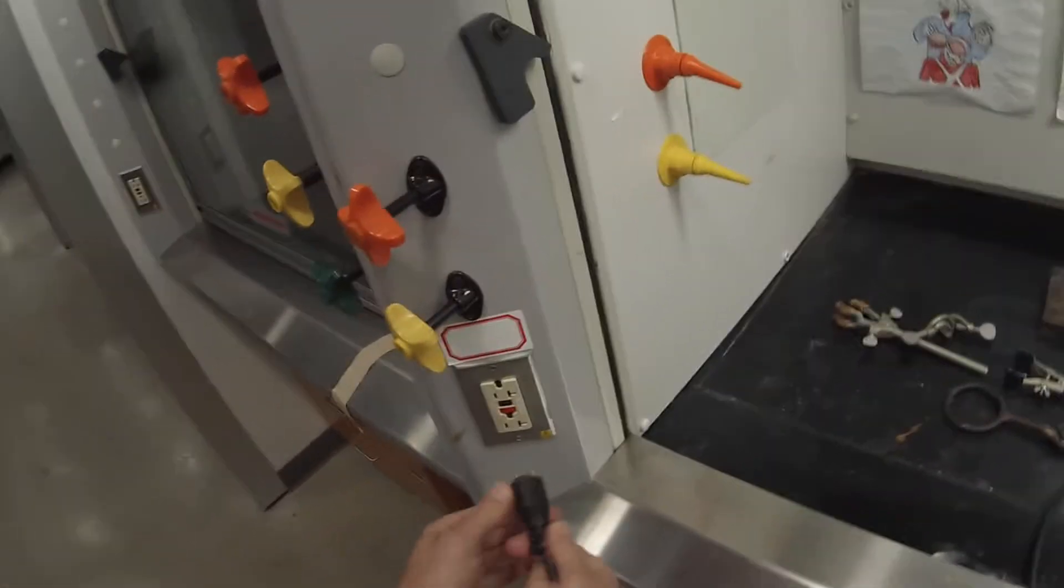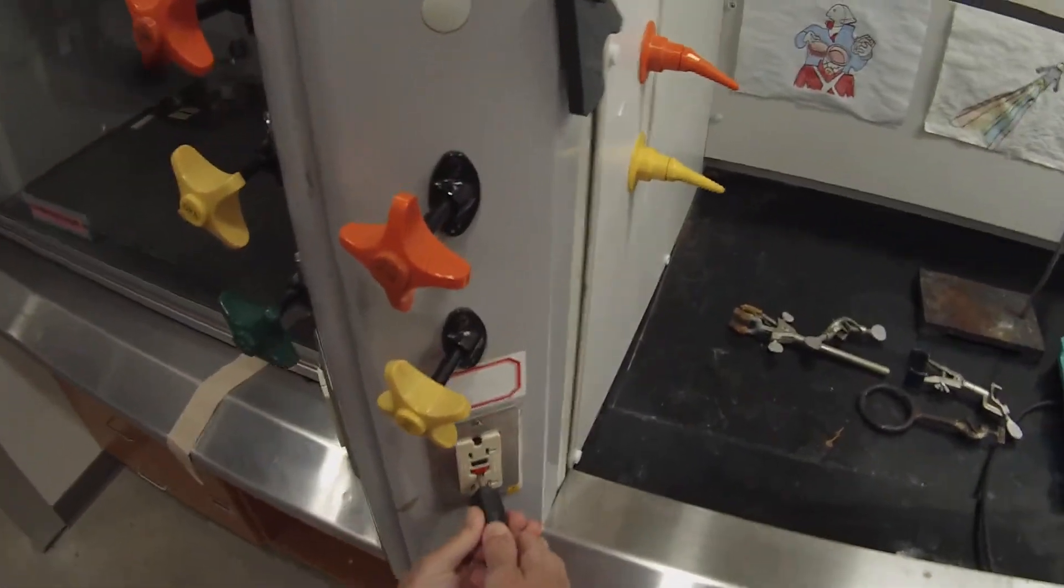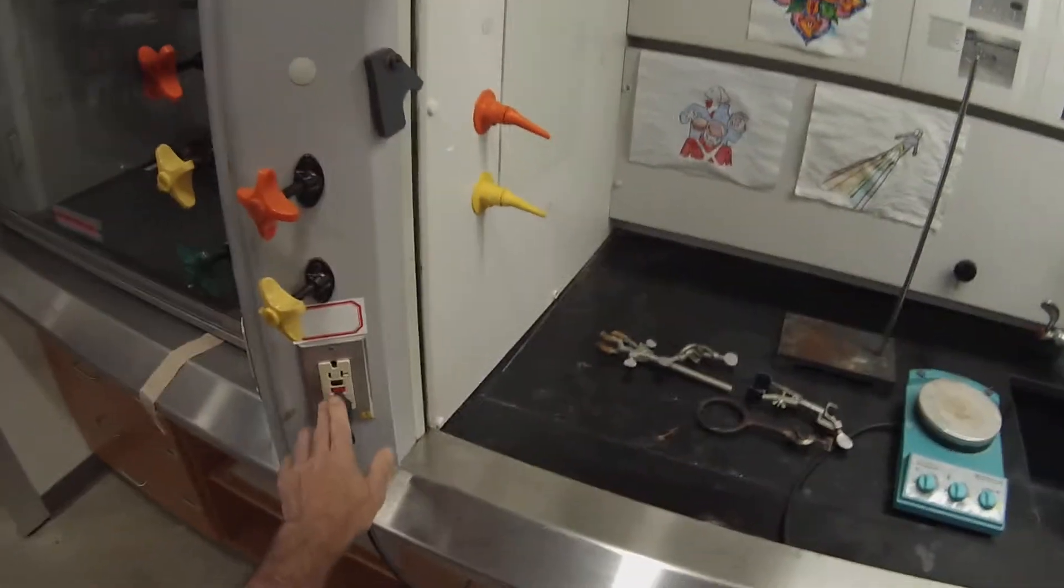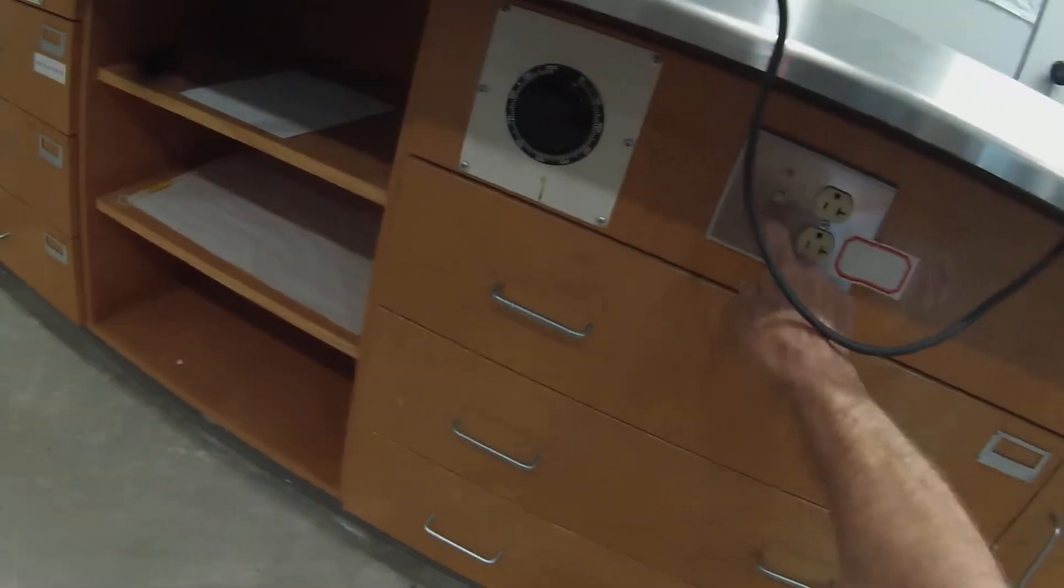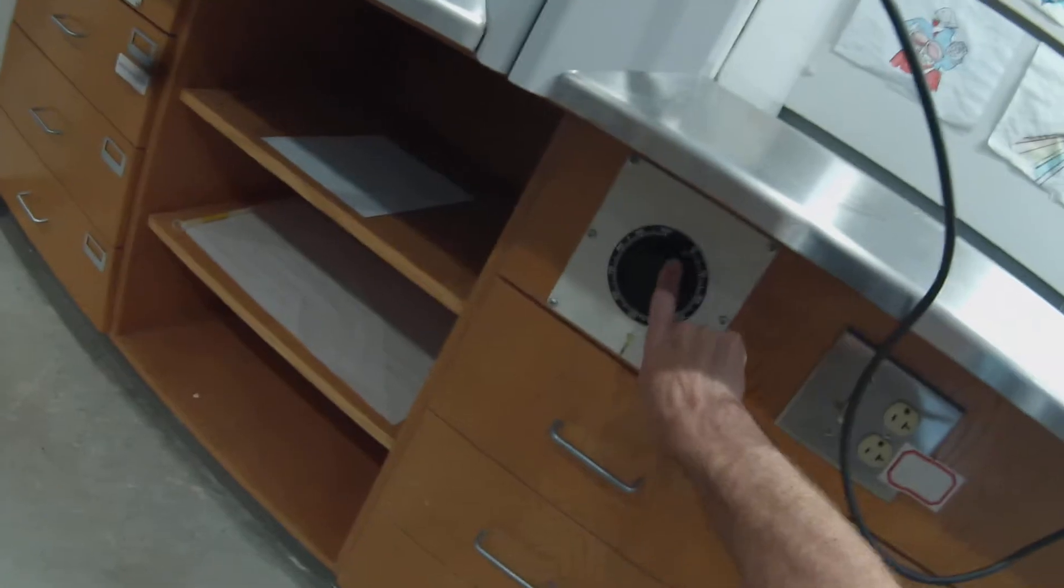This will allow us to heat and stir our material. We'll run the cord through here so it doesn't get in our way and plug that into one of these outlets. There are two different kinds of outlets in the organic hood. This one is connected directly to power, and these down here below the hood are connected with an on-off switch to a variable voltage controller that allows us to put zero through 100 percent of the voltage through.